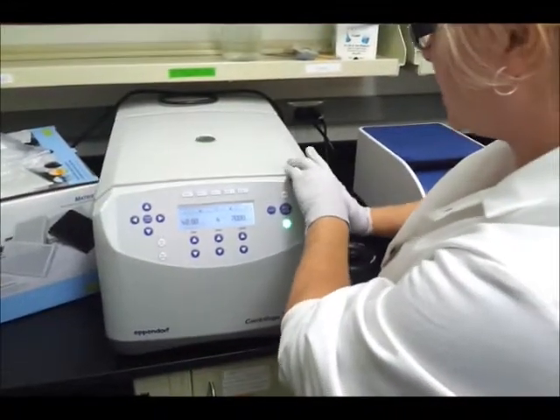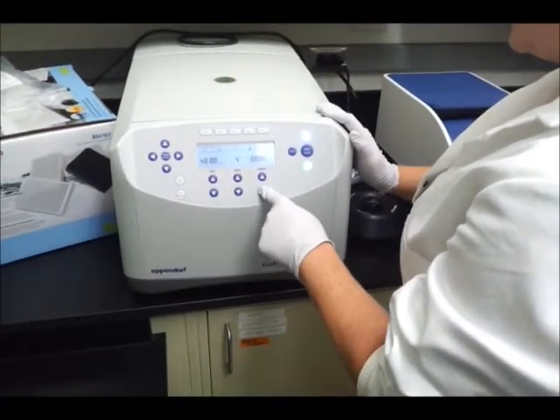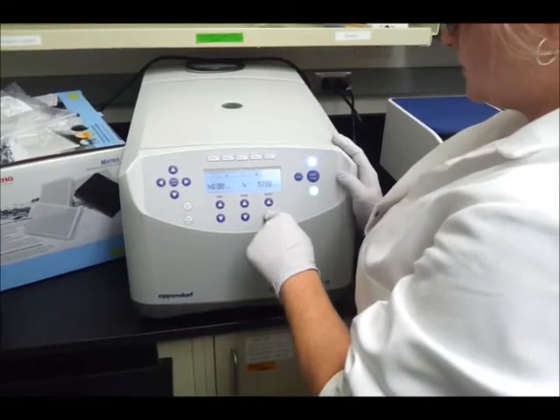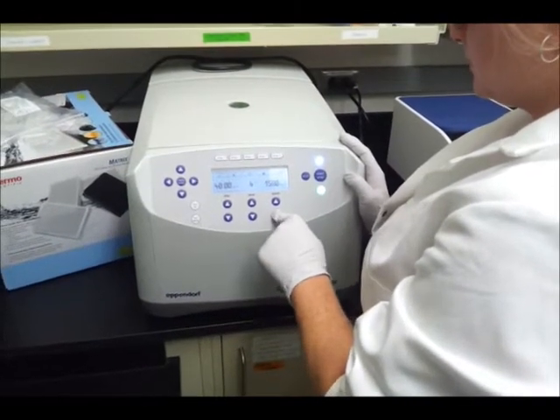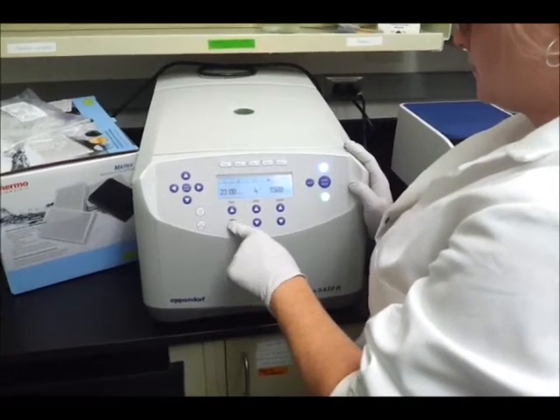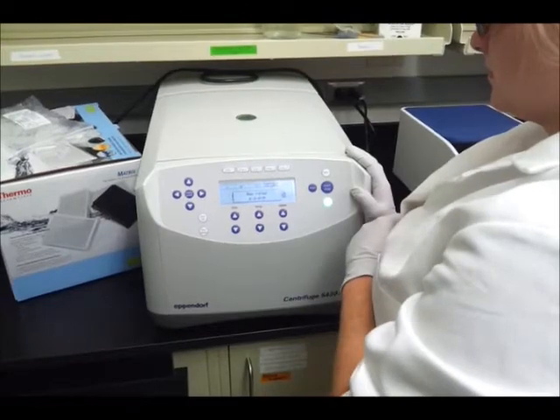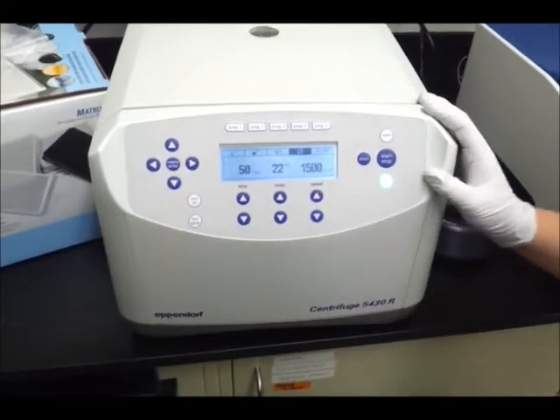You close it. I can't remember the exact highest speed that this guy can take, but I know that 7,000 is too much. So I'm going to go to 1,500 and see if it stops me there. I'm going to do it for a minute. Let's see what happens. So it's saying, oh, new rotor, but it's good to go, so it's going to spin it down.